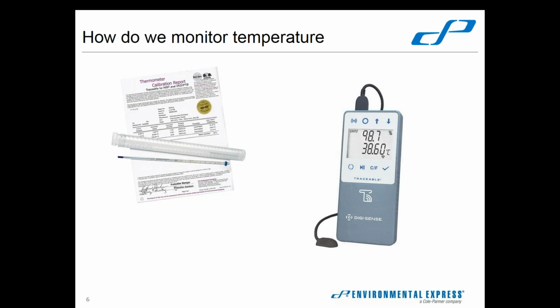When I was in the lab, the last time that I actually had hands-on experience doing these, those NIST thermometers, the liquid in glass type, I think that's what they're called, were the one and only standard that you could use. Since then, I know there have been several options brought with NIST traceable digital type thermometers, and those things may be of use to you now.